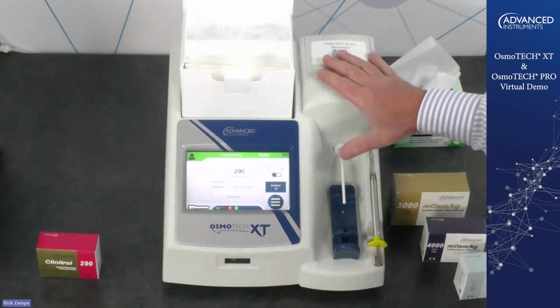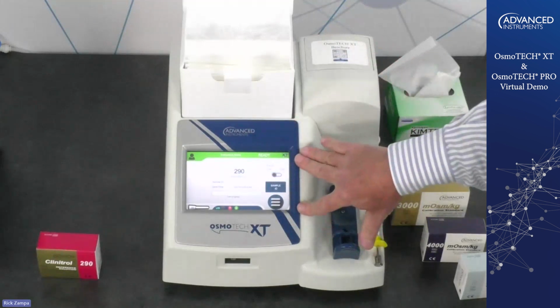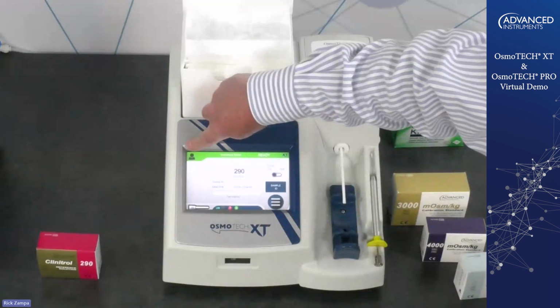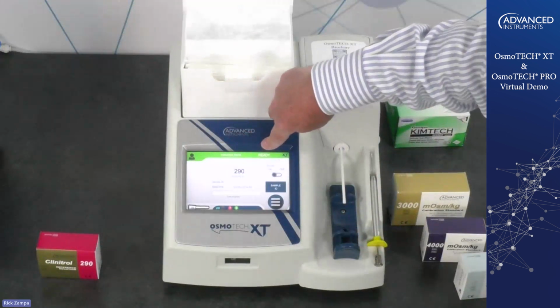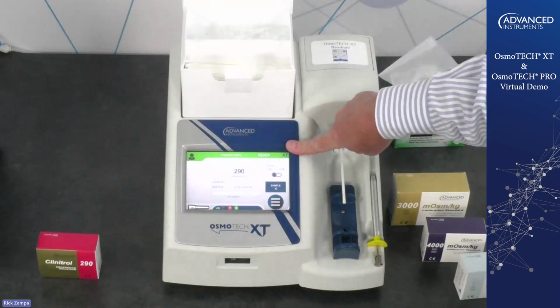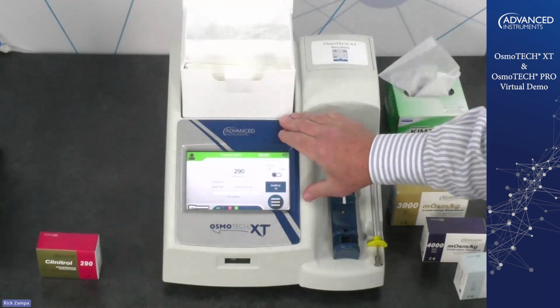So first, a basic overview of the instrumentation. We have our touchscreen display here. You can see up at the top, it says ready, and it shows the instrument name. It's green, so it shows it's ready to go, easy to see from any kind of distance.